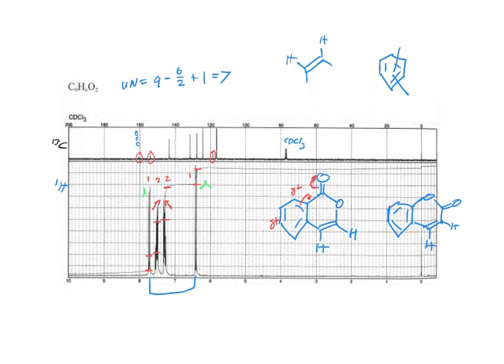But what I would say is that this carbon here is a protonated carbon rather than a quaternary carbon. And I think that this one, because it's so small, is probably quaternary. Right? So I would say that, in fact, this one is likely to be this one over here. Seems reasonable. And then the other one, the carbonyl, fits there.